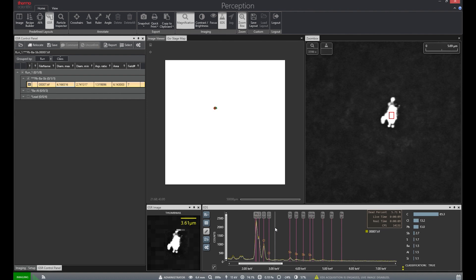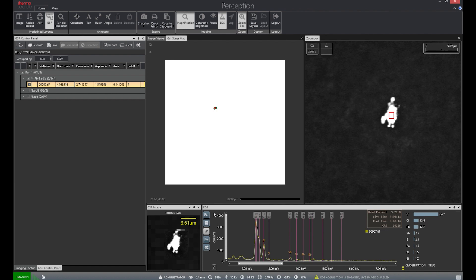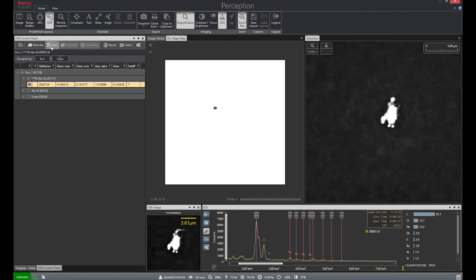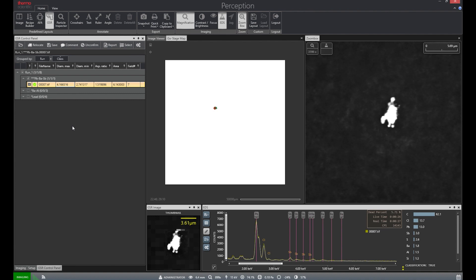We can also label elements on our EDS spectra to confirm the presence of lead, barium, and antimony, and then click save. On the particle list, a green check mark will appear indicating that we have manually relocated and confirmed that this particle is indeed lead, barium, and antimony.